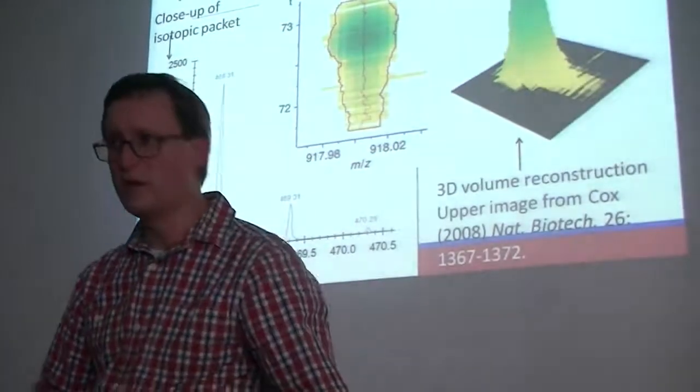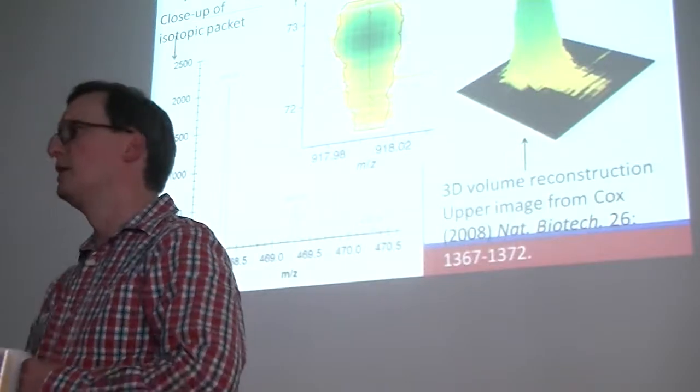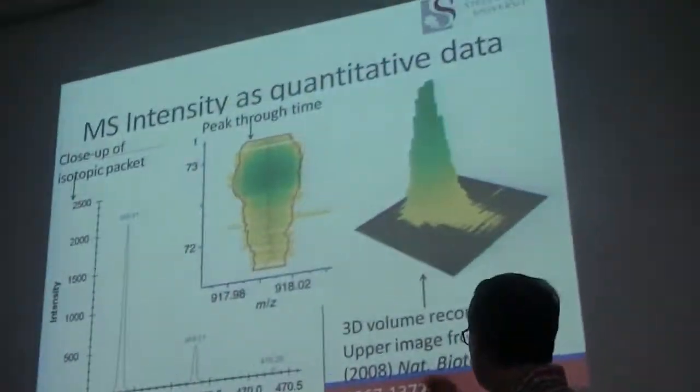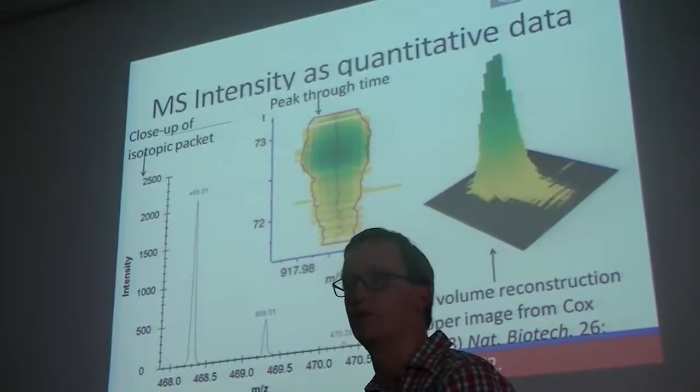And probably the big one that I see used all the time in South Africa in particular, and in Europe, is called MaxQuant. It was created by some researchers up in Germany. Jürgen Cox is the lead author on this paper. Matthias Mann, his mentor, was the senior author on it.